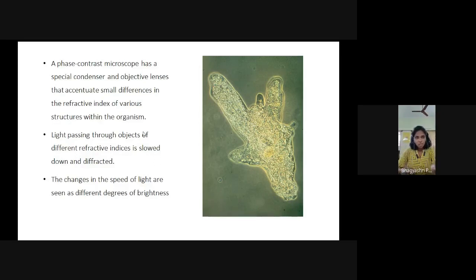But the phase contrast microscope helps to diffract the light on each and every plane that the sample has. That is how each part of the object is seen differently in a phase contrast microscope. This technique is also useful for organisms which cannot sustain the staining procedure, whose morphology will change because of the staining.